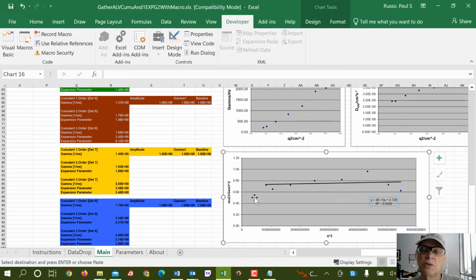And we know that because if you look at the mu2 over gamma bar squared plot versus q squared, we see that the overall value is well above the 0.3 threshold. We sort of look at 0.3 as where it becomes sort of plausible to make good CONTIN inverse Laplace transform plots. There's nothing magic about that number. That's just based on long experience.